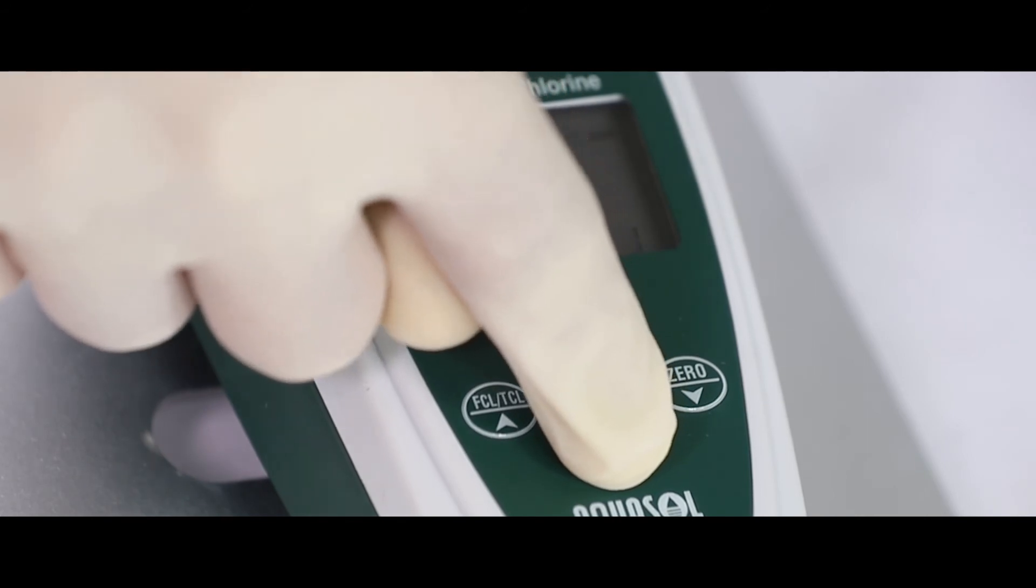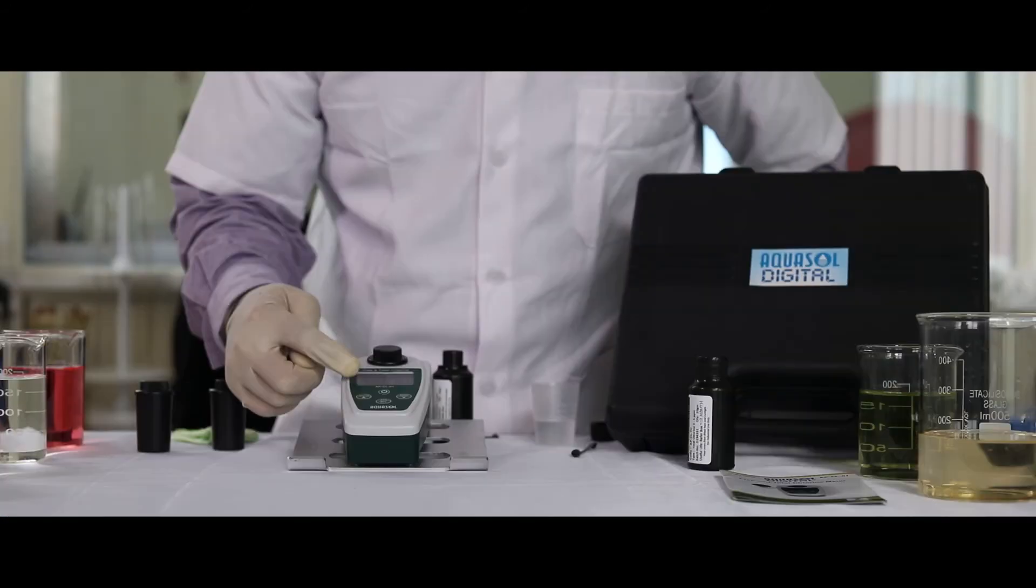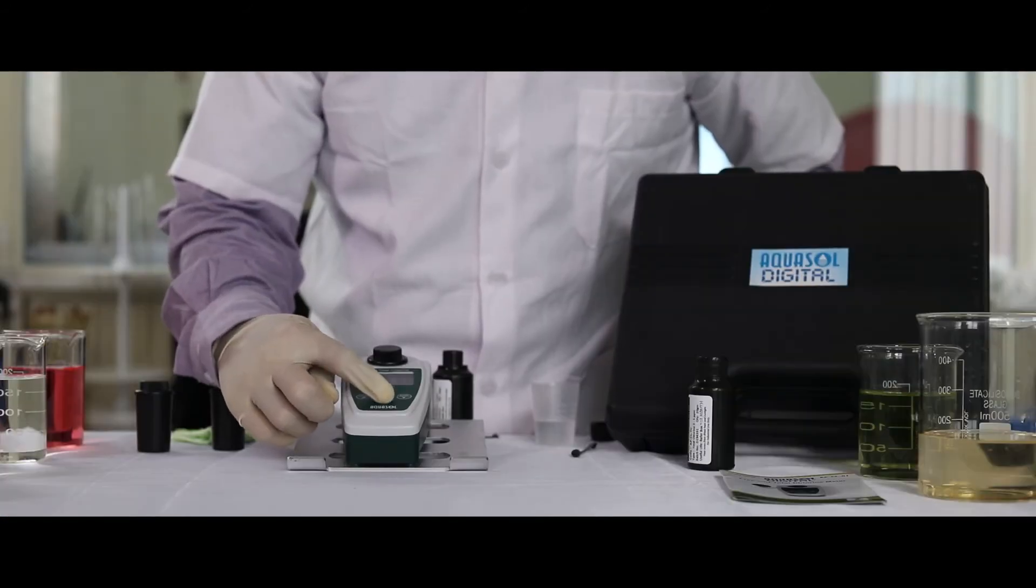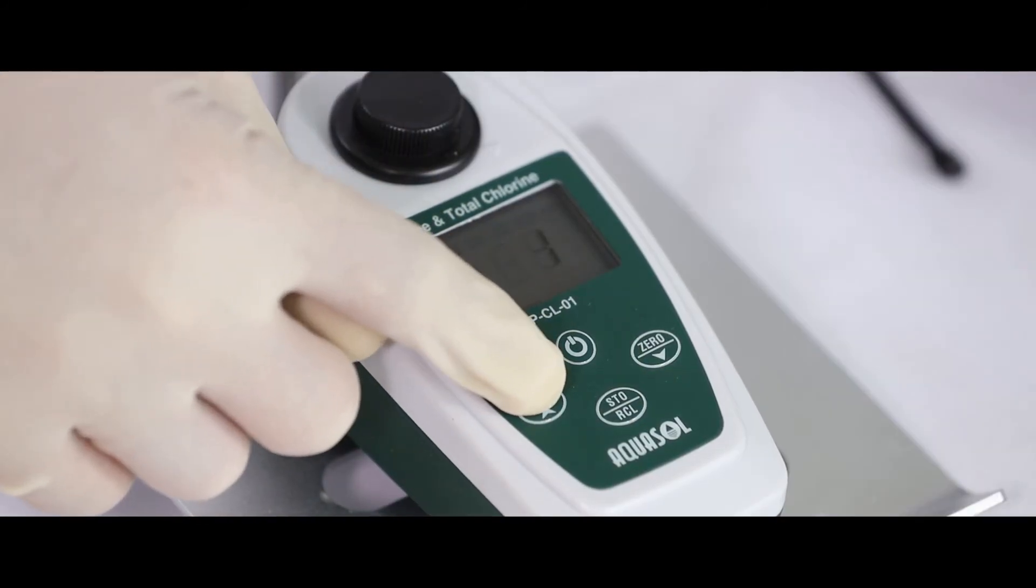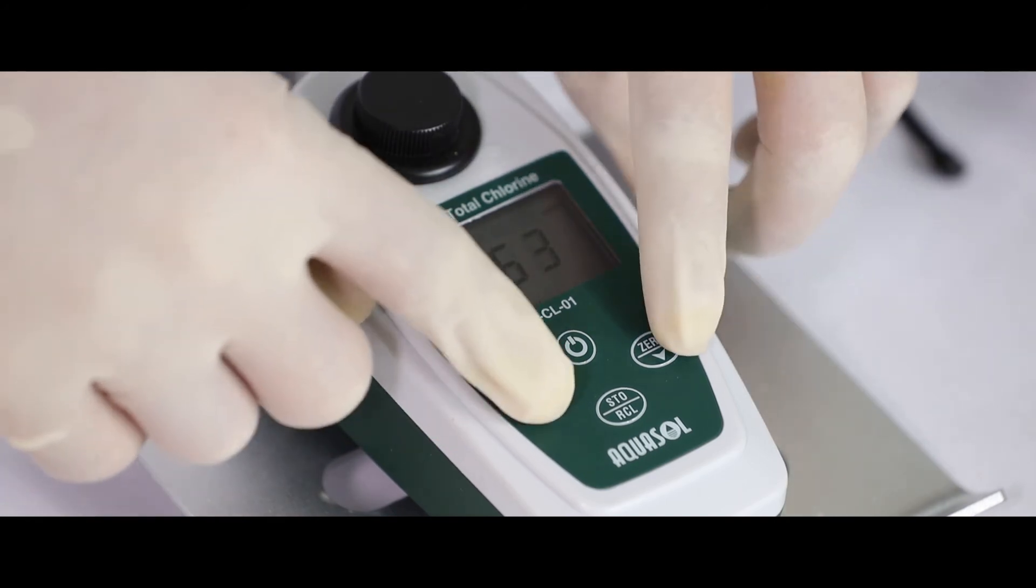Press STO slash RCL key to store the readings. To recall the readings, press and hold the same key. Use arrow keys to browse the stored data.